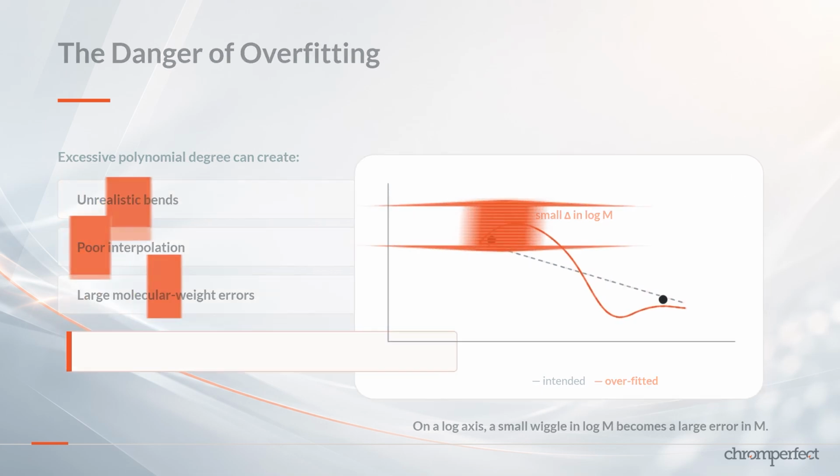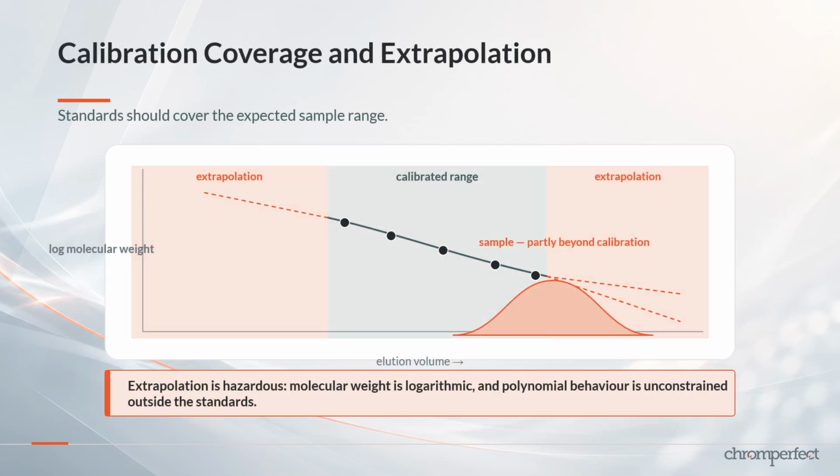The calibration standards should cover the molecular weight range expected in the samples. Extrapolation beyond the standard range is particularly hazardous in SEC because the calibration is logarithmic.